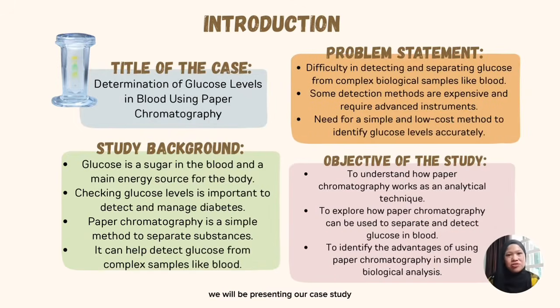In this video, we will be presenting our case study for analytical chemistry entitled Determination of Glucose Levels in Blood Using Paper Chromatography. We chose this topic because it relates to real-life application of analytical techniques, especially in medical field.